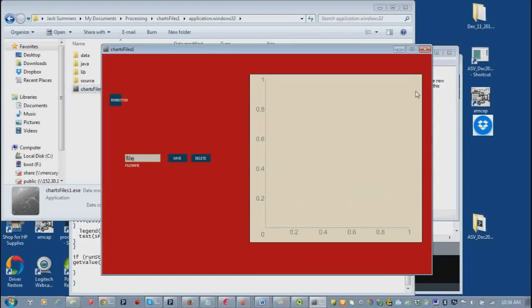And as you can see, it's pretty simple. We have this chart area over here. There's something up here called Run button. We have a file name box, and we can name our files any way we want. The way that I train my students to do it is to start off with your initials and then perhaps a number for the laboratory book you're working with, and if that's 4, it would be a Roman numeral 4 like that. Then I put a page, and let's say we're on page 32, experiment A. All right, now we're ready to go.